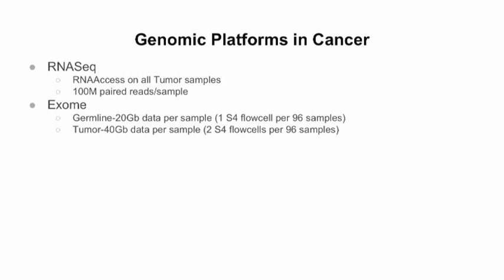One of the main reasons this is done is the variability between samples, the variability on those qualities, is by sequencing at this depth and really never having to do top-up sequencing. So some will be well overcovered, but almost everything always hits passing metric first time through. Turns out, just because of the volume of samples going through, very, very handy. But these are the specific sequencing conditions. These are at paired 100 as far as actual read lengths.